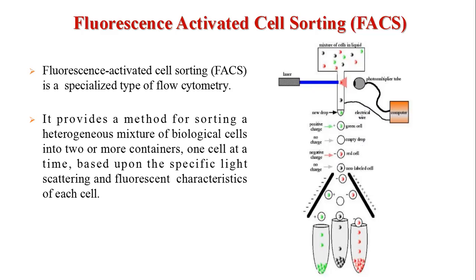In case of FACS, a sorter is there, but the sorter is absent in flow cytometry. Here you can see the additional attachment that we haven't seen in flow cytometry. This is an electrical attachment that imparts some charge to the cell type, and then the cells are collected in different collectors. This is called a fraction collector.